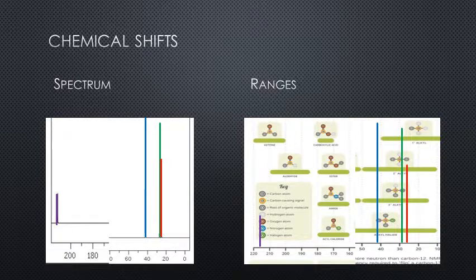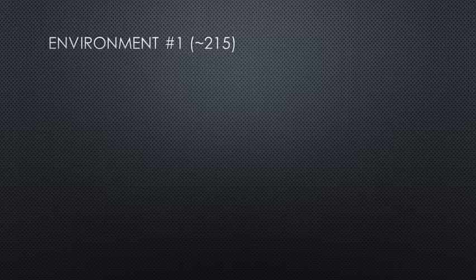So if we look specifically at our chemical shifts, we have some segments here that I spliced together to make them a lot easier to read. So we have our 4 different groups. So we're going to look at each one individually just to make it a little easier.